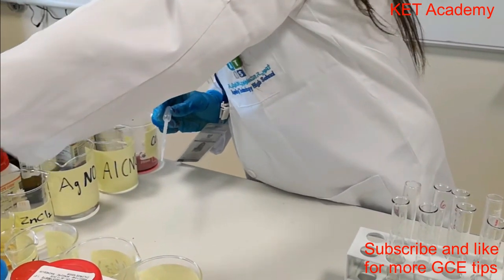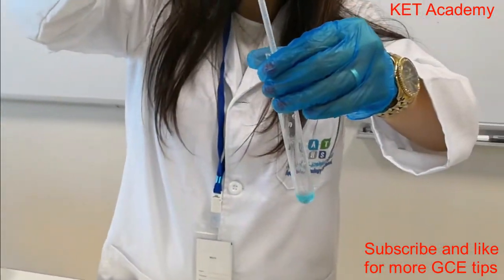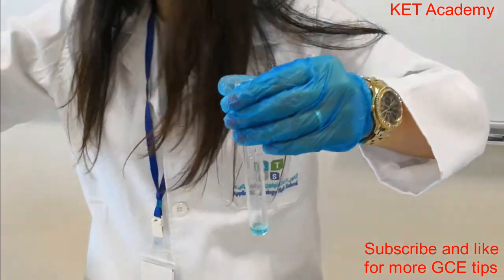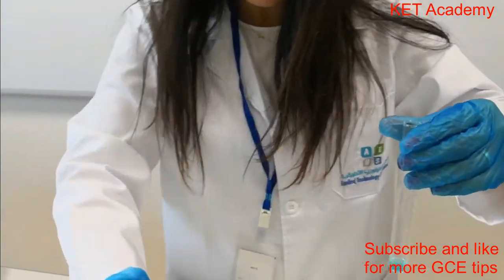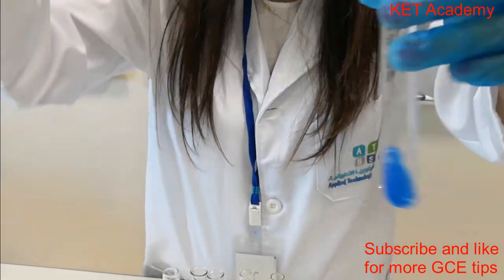Now let's try the copper. The copper is a blue solution, copper 2. Upon adding sodium hydroxide, it will give a blue precipitate.